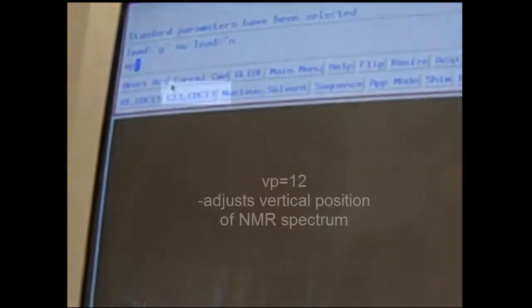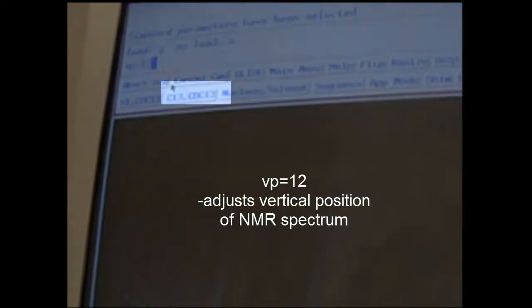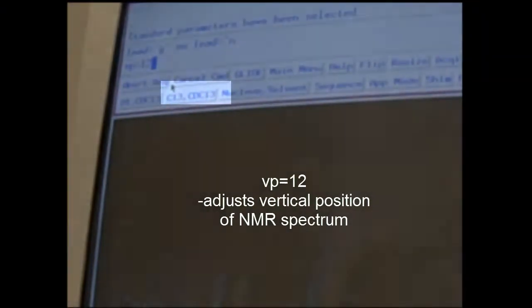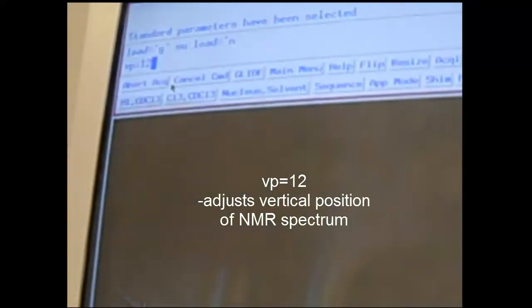Now that that's been loaded, I'm going to type in another command, BP equals 12. This simply is a processing command that helps you print things out, but even if you run 20 samples, you only need to type this in once. At this point we're ready to insert our sample.